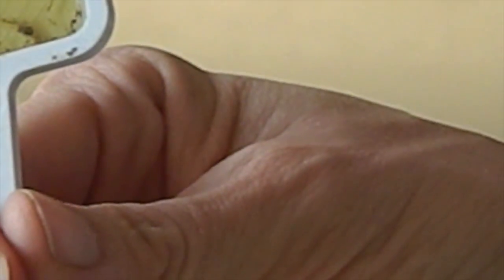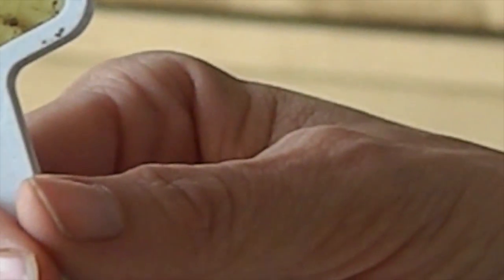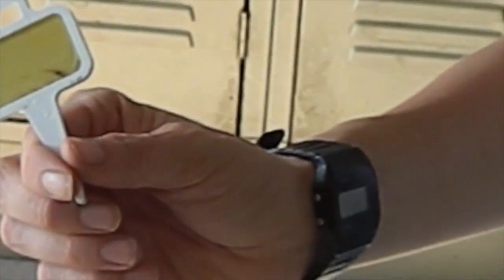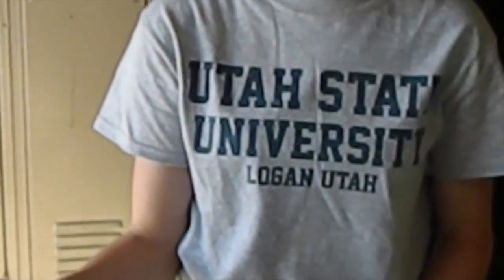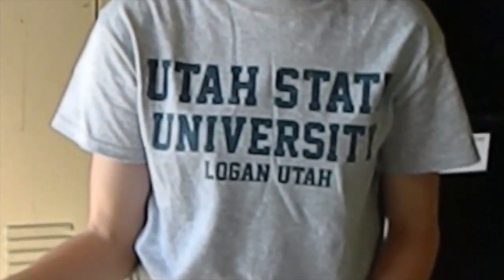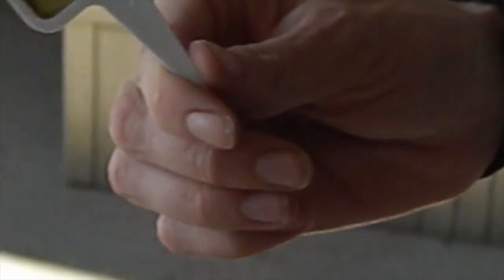This is the paddle, and a yellow color is a sign of high respiration, which is typically a good sign. Unless you have really pale soils and not a lot of organic matter, it could mean your soils are burning up organic matter faster than it's replenishing.